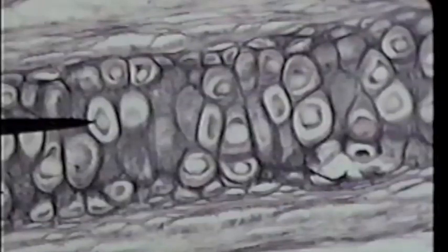Here we see a lacuna with a cell inside. Remember that when the cell was living it filled up the entire space we see as the lacuna, but when the tissue died the cell shrank. The tip of the pointer now is on the cell within the lacuna — this would be considered a chondrocyte, a nice round cell found deep in the interior of the cartilage. The chondrocyte is responsible for maintaining the cartilage that has been laid down.